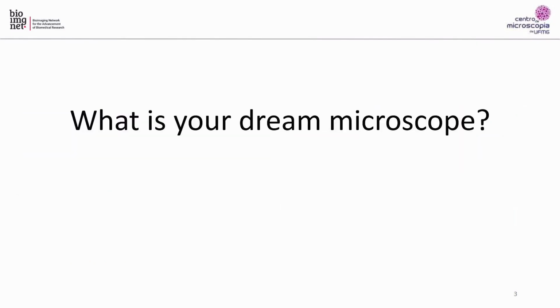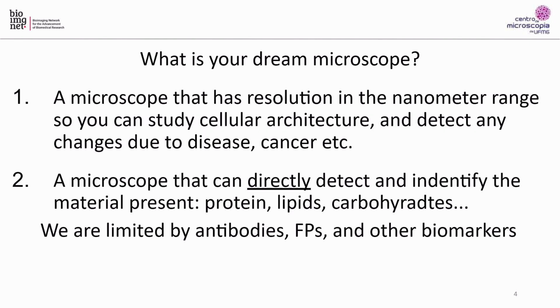But the point I want to get to, and this is when I want to ask this question: what is your dream microscope? So Lionel has hundreds of dreams, sometimes nightmares. I think all of us have gone through this phase where you've been around a couple of years and you all have the microscope that you want. Most of those will be something where you have resolution in the nanometer range so that you can study cellular architecture at a high level and detect changes when you compare diseases and other methods. So that's a pretty good basic goal.